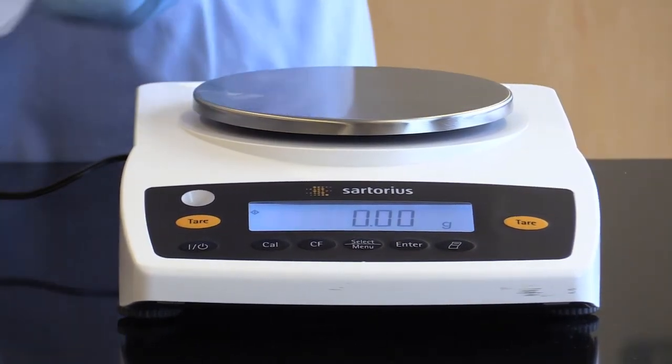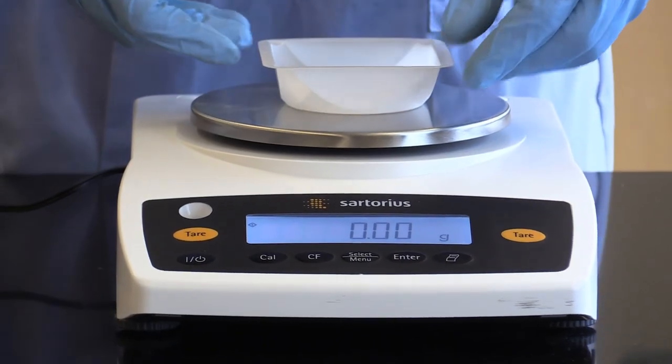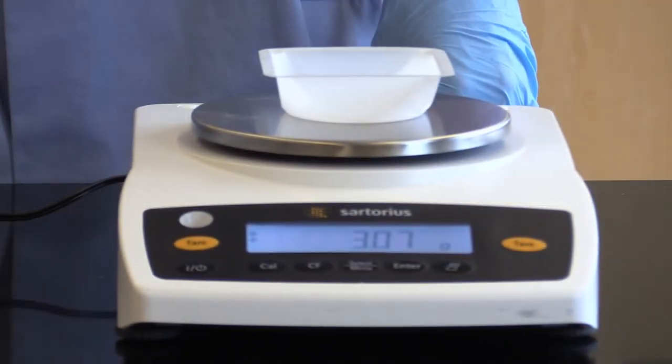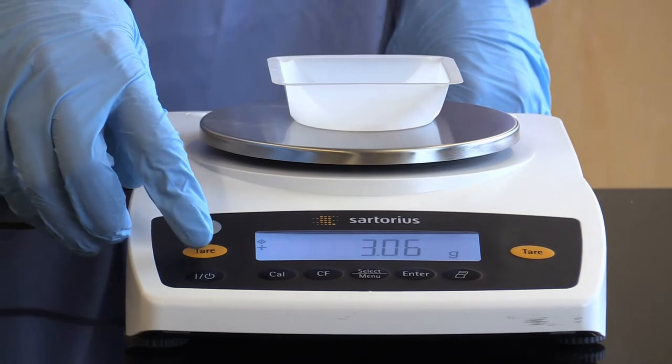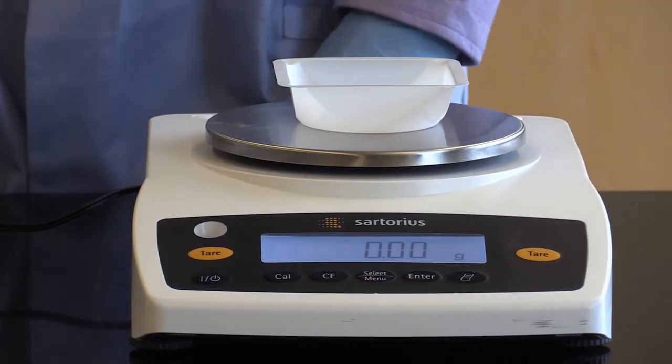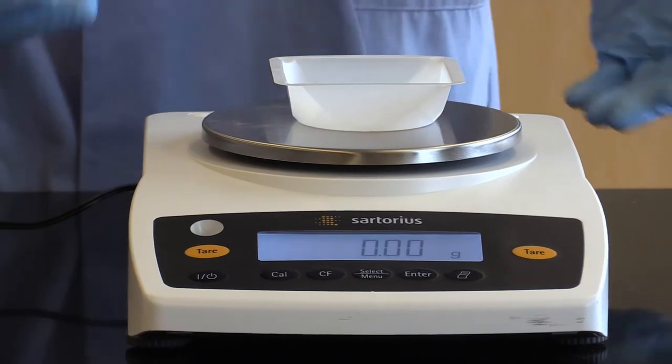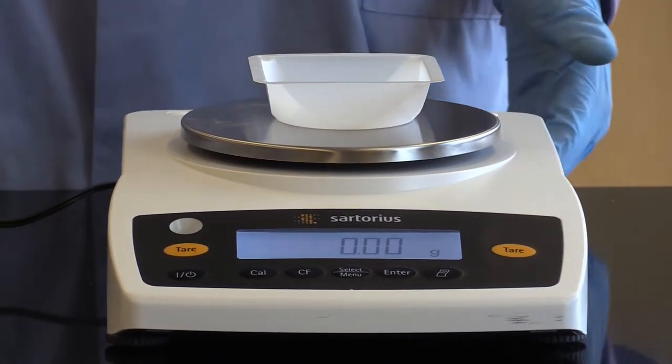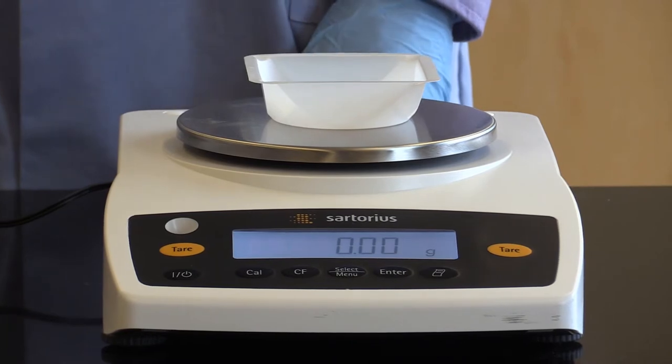And then we're going to place the weigh boat on the balance and then hit tare. What tare will do is zero the machine, so you should see 0.00 if you're using this type of balance. If you don't see all zeros, then you're going to want to hit tare again.